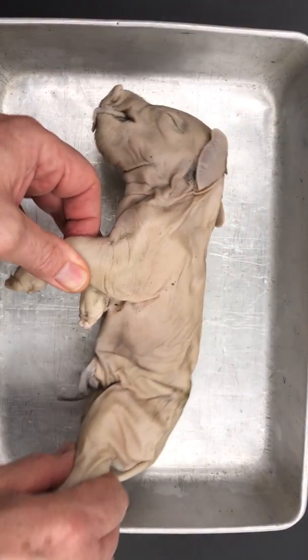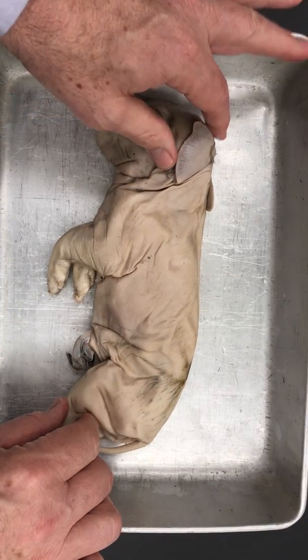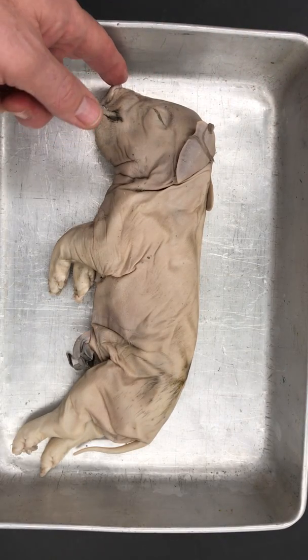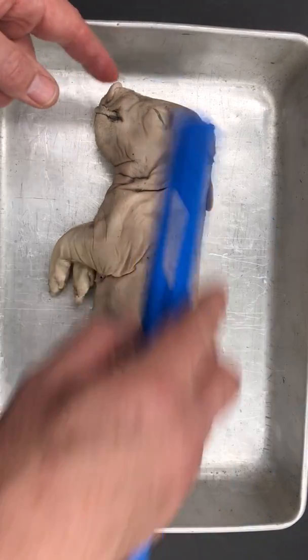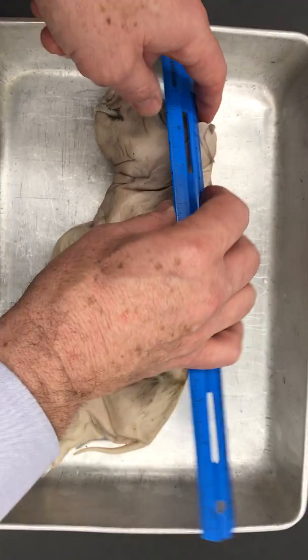So the first thing you're going to do is take your little guy. How do you know if it's a guy or a girl? We'll figure that out in a little while. And we're going to measure it. You're going to measure it from the tip of the nose, tip of its snout to the base of its tail. So here's the base of its tail. So I'm going to take my ruler, kind of run it around there.